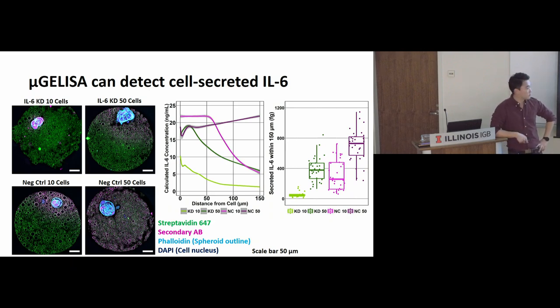As I said, you can do a differentiating organoid system. So basically, you can do that by using the scaffold and then maybe add some of the sensing gels in between, so that you'll be able to sense what the ECM effect is. But there's other ways too, right? You can just get the media out in that case. If you want to see spatial resolution, sure, do this. But it's more of a bulk thing.